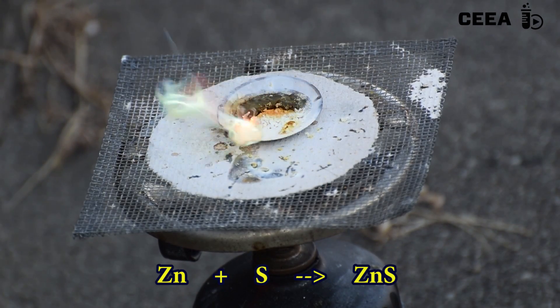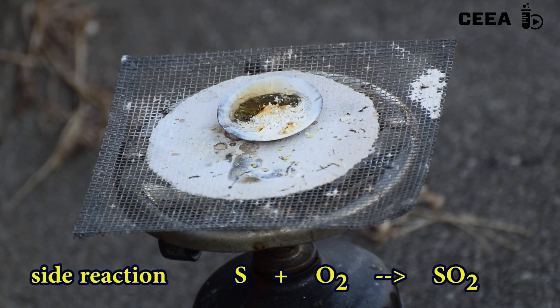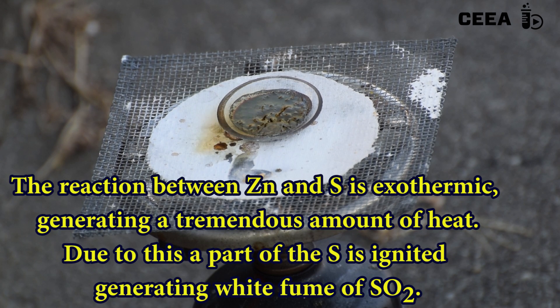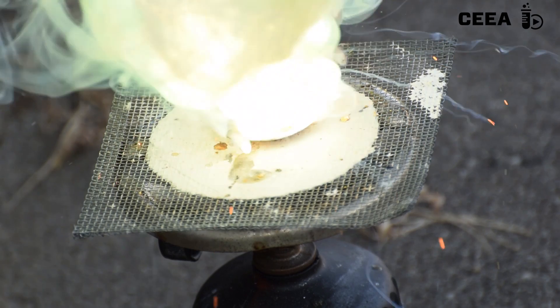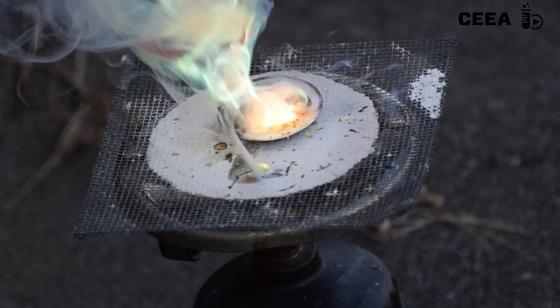As a side reaction, we witness the burning of sulfur, with an abundant white smoke being evolved. Notice also that the formed zinc sulfide is yellow and hot, and it becomes white on cooling.